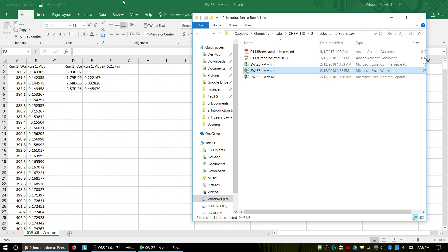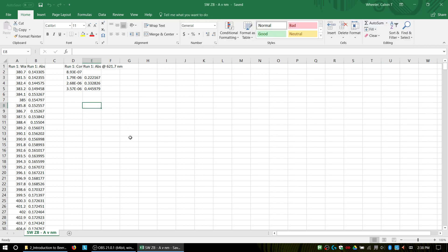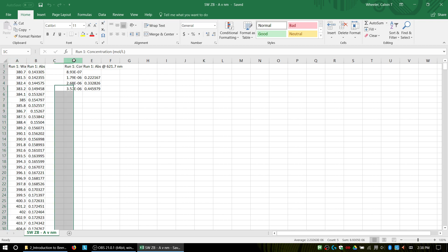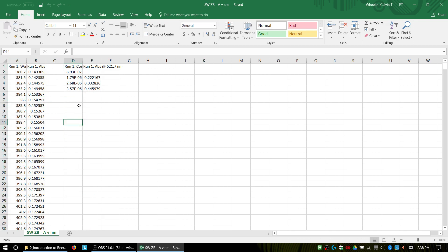So I am working in this document. You can see I have two data sets: my full spectrum data, as well as my calibration plot. Whoever's data this was did not take an absorbance somehow, so I'm just going to take that data out. They probably have it in their notebook.